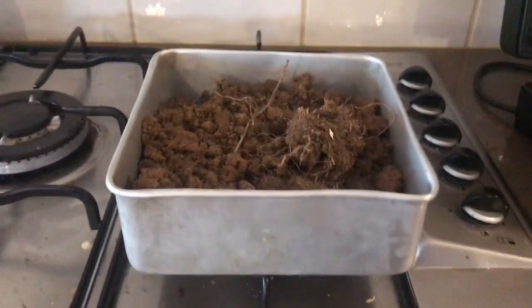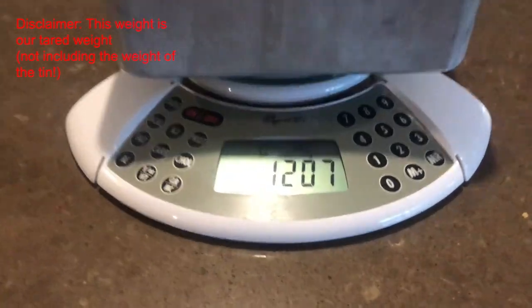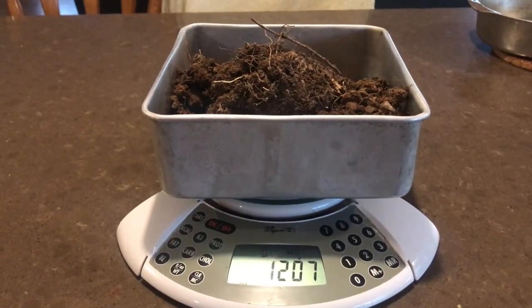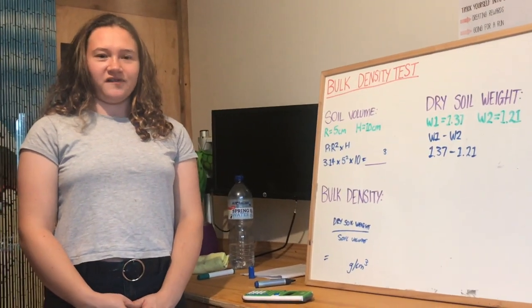We'll let that cool down and then we'll weigh it again. There we have it. Our dry soil weight comes to a total of 1.207 kilograms. Now we can go to the drawing board and calculate our overall bulk density. We are now going to calculate the bulk density of our soil sample.